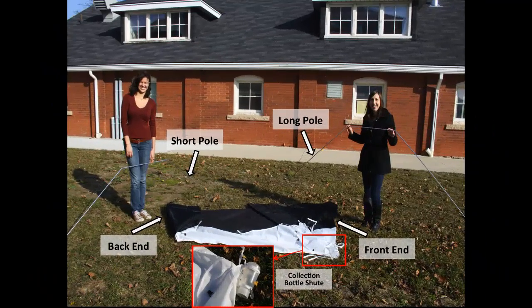Unroll the trap and extend the two poles. The short pole goes at the back end of the trap. The back end is the end without the collection bottle chute. The long pole goes at the front — the front end is the end with the collection bottle chute.